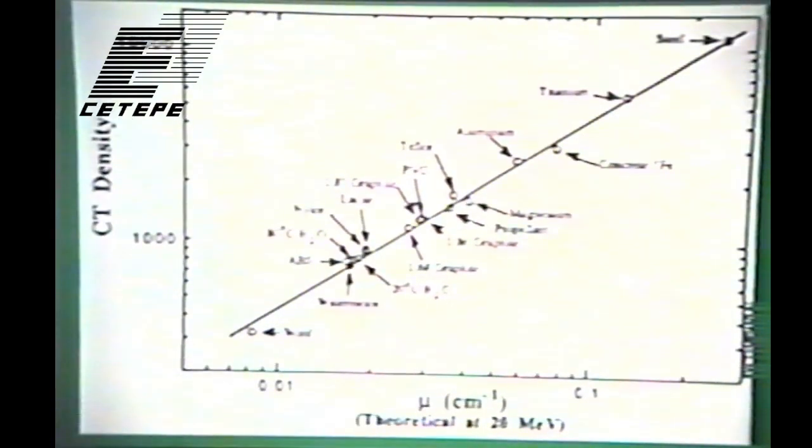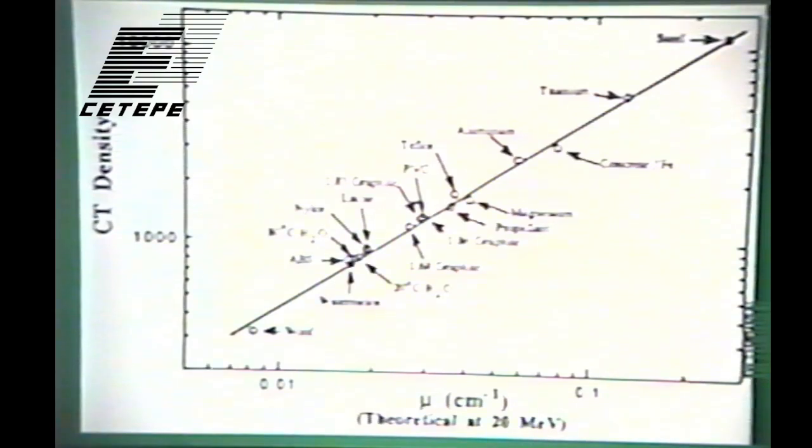These are much denser than the body, so you have to have a whole other technology. And that also has implications on what kind of detector you can use, because these granular phosphor layers won't stop very many 20 MeV photons, so you have to use these columnar crystals at a minimum.